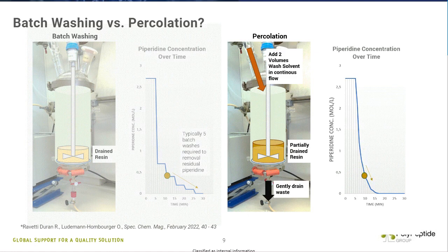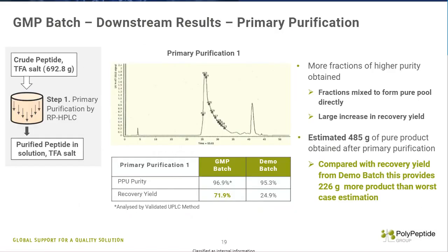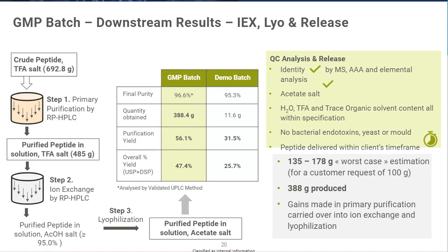Yeah, so like I said, this is described at the end of the presentation, so I'll just go quickly. Of course, this is also something that we discuss with the client essentially from the beginning, in terms of their specifications. This is a very common thing that we test for in terms of the content of the peptide itself. So in the powder, we have water, we have TFA, we have our counter ion itself, and we have other maybe trace solvents that are used in the process. These are all tested for either by GC or by ICP and quantified. So these are all done through quantifiable tests.